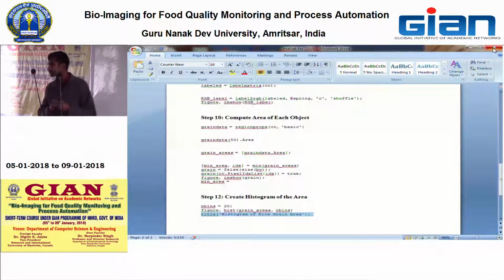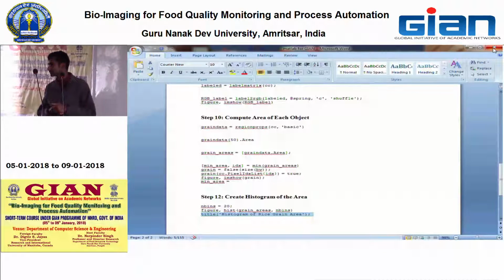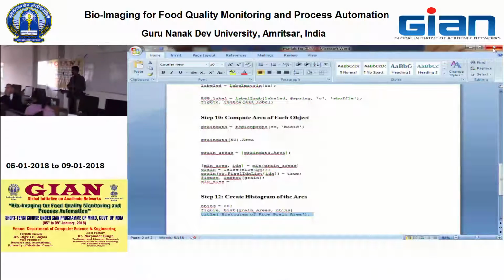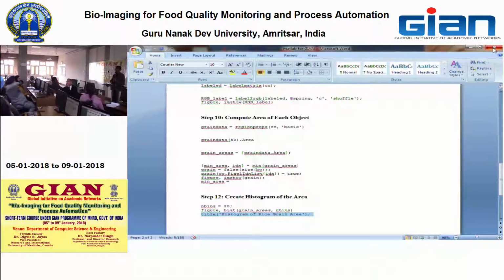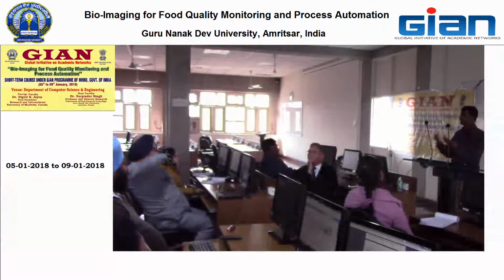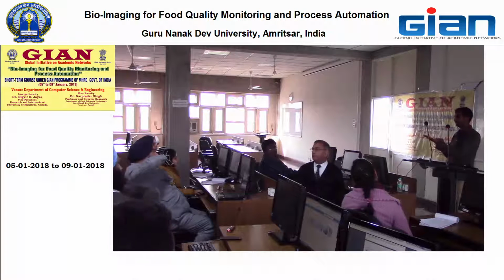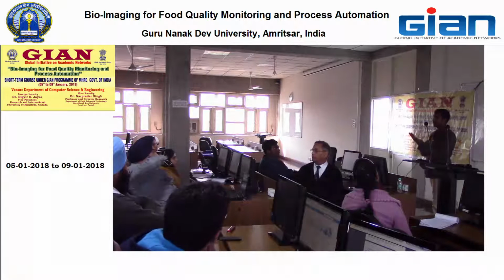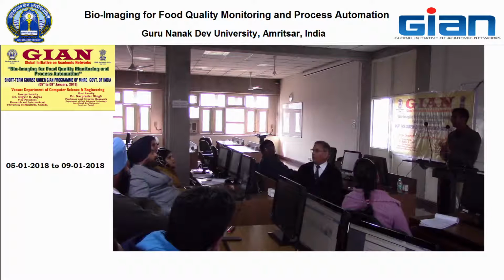When you have the digital kernels, I understand that we can do this. But for example, with a bread slice, I think it would be very difficult to distinguish between the background and the sample. No, with the bread, if you take an image of your whole bread slice, there is no background in that one. Your whole bread slice becomes your image, so there is no need to segment it.